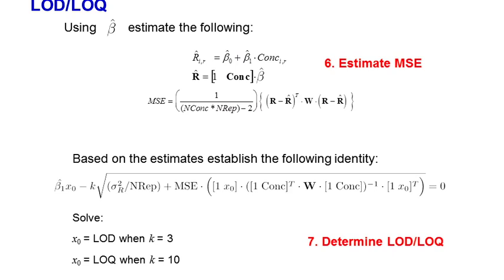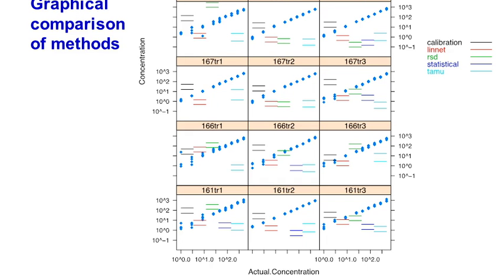So it has a very complex variance model, but because of that complexity, you need a lot more data than 3 replicates per point in order to fit this properly. So there were issues in fitting this model. I think Cliff Spiegelman at Texas A&M, his group came up with the model for the data.